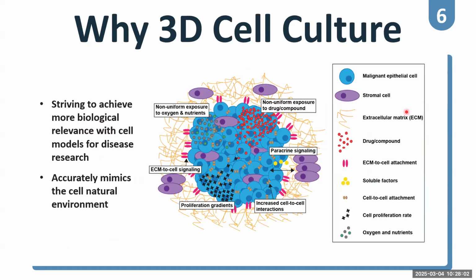The 3D model has become a game changer in disease research. One of the key factors is its ability to achieve more biological relevance than the traditional cell culture.